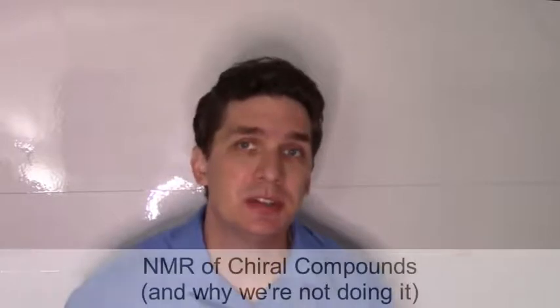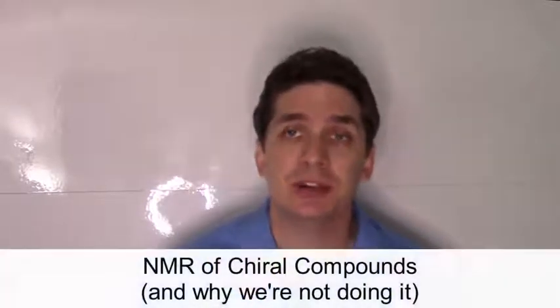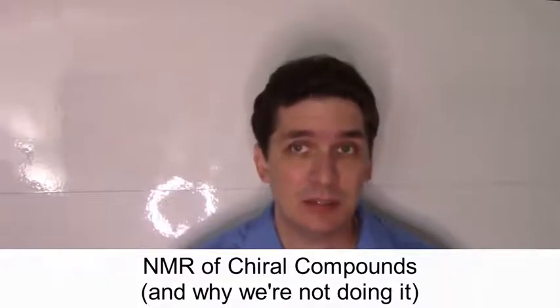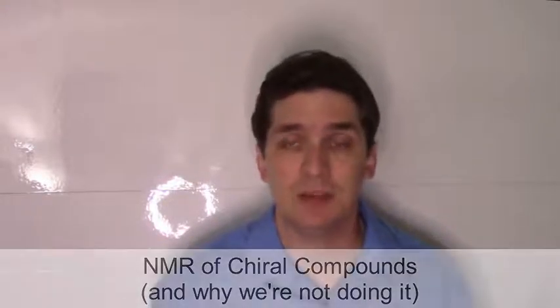All right, so let's talk about NMR of chiral compounds now. And this has actually kind of been an interesting experiment for me to go through and try to understand this. Because if you look at NMR of chiral compounds, there's software that will predict it and it gives what I assume are accurate predictions. I don't know. But in terms of people explaining it, I really haven't seen that much online.